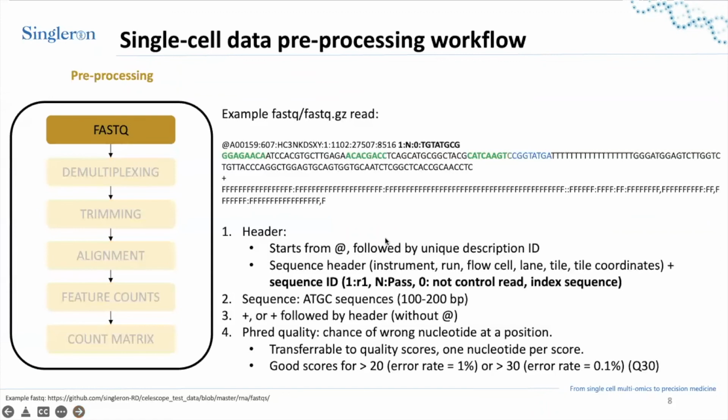We have not done a thorough comparison or survey for the reads with different sequencing platforms. I cannot say for sure, but I suspect the Fastq sequences may depend on multiple factors, and the sequencing platform or sequencing company may be part of it.